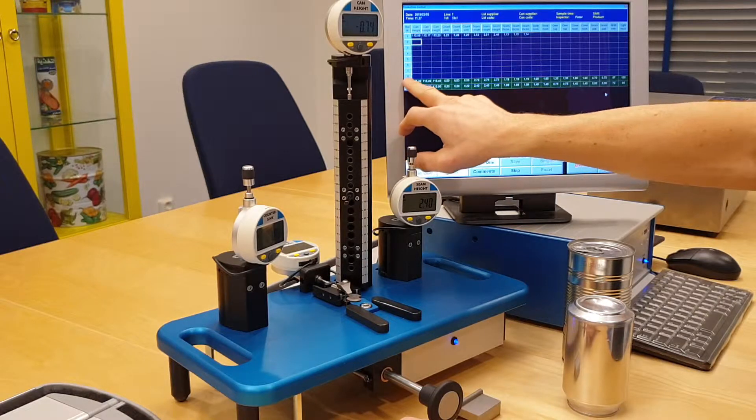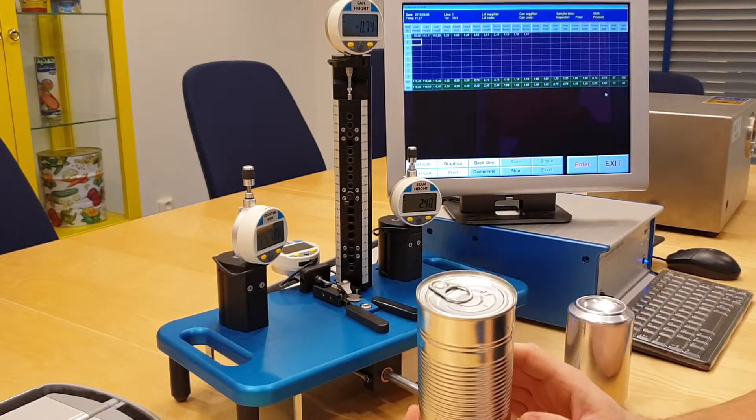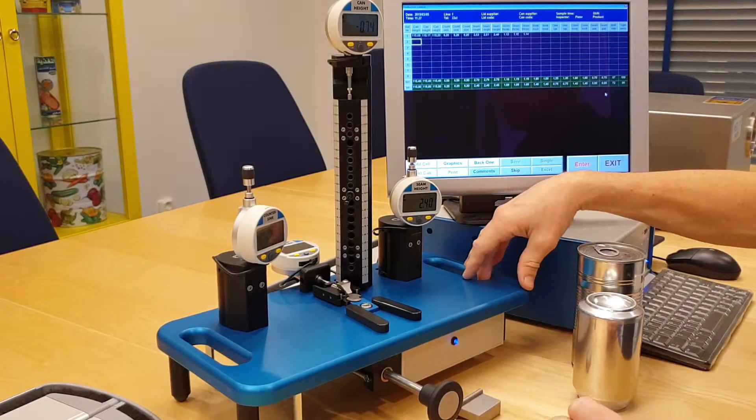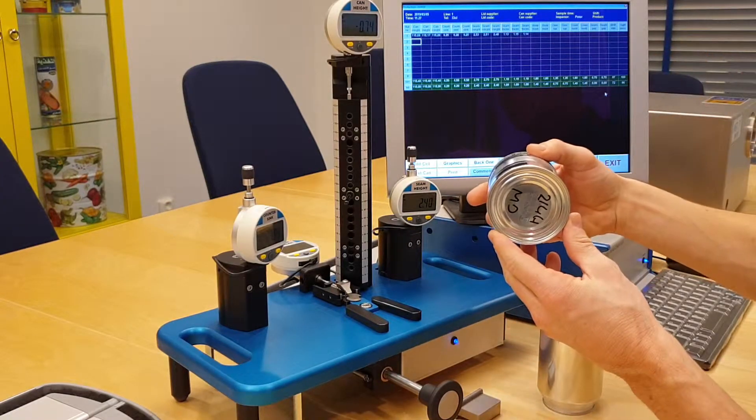Then you go to can number two, and so on. It also works for beverage cans. This mini desk version comes in different sizes.